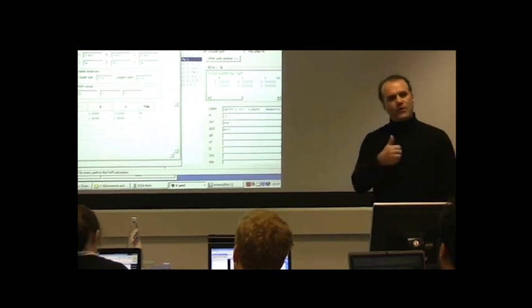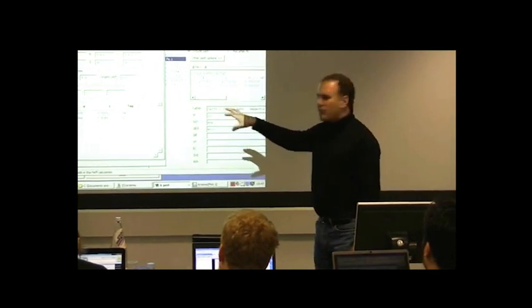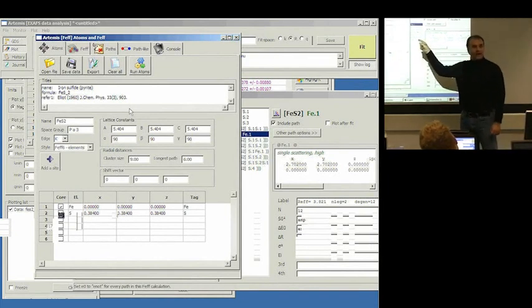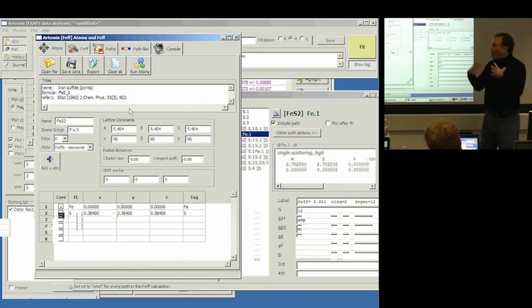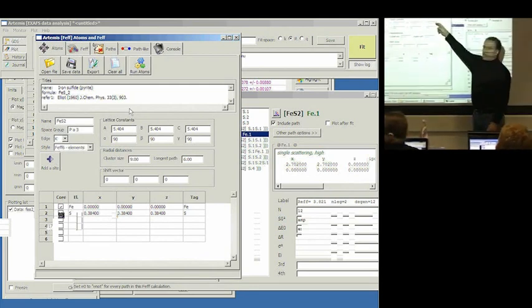There's really only one parameter that determines where all the atoms are in the crystal. And that one parameter is the lattice constant. When we ran Feff on this crystal data, we either used the correct lattice constant, that is a lattice constant that's consistent with the EXAFS data that we measured, or our lattice constant is too big, or our lattice constant is too small. And all of the distances between atoms basically come down to exactly what the value of this number is.